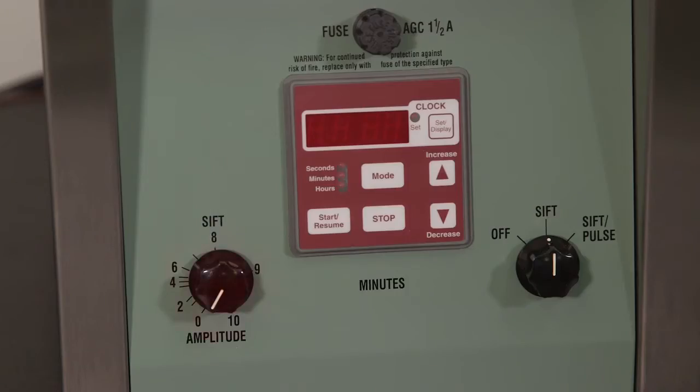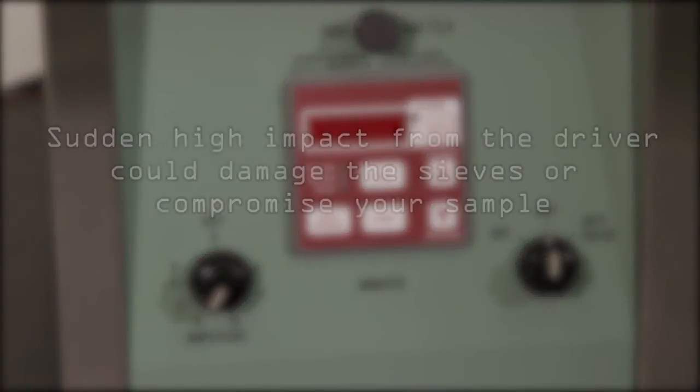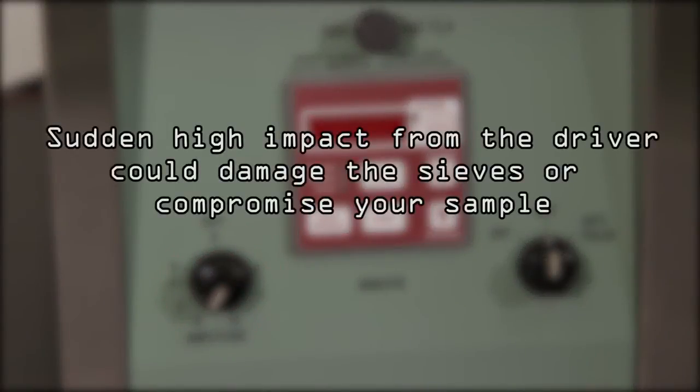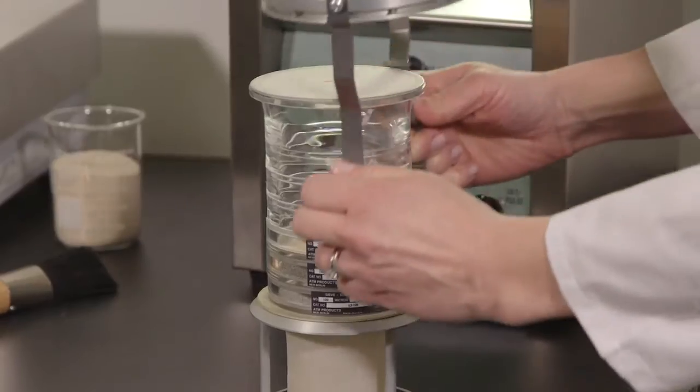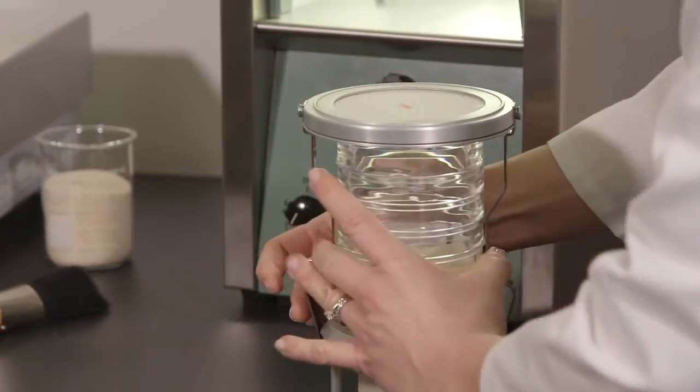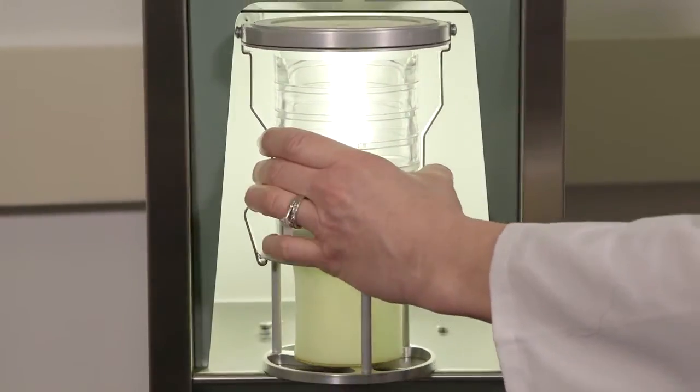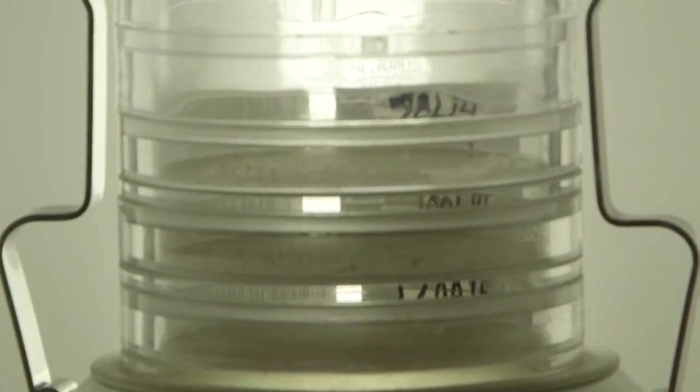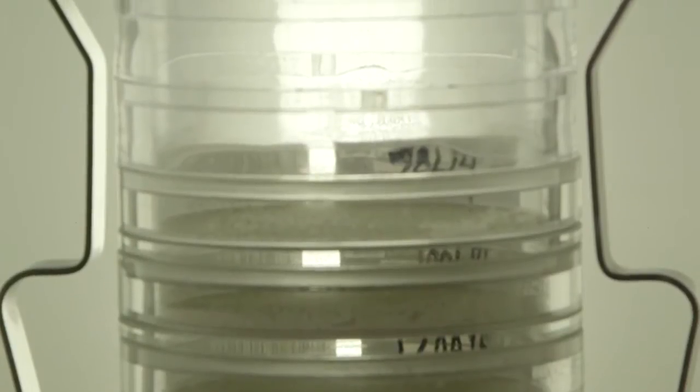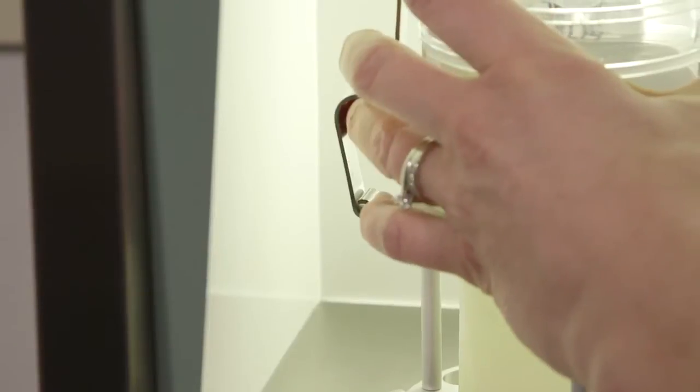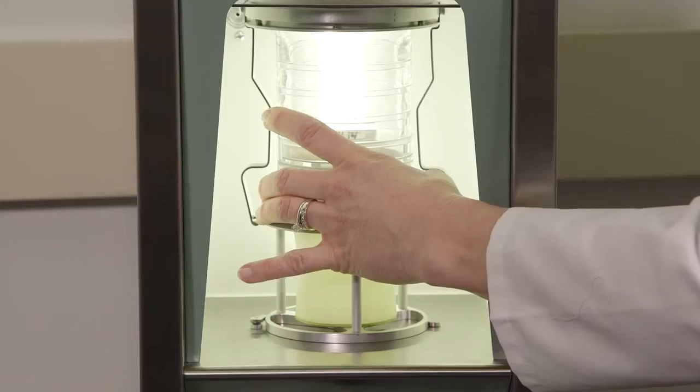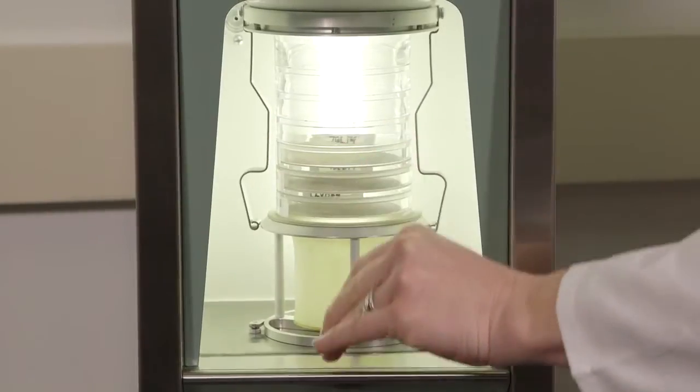Make sure the amplitude is set to zero and the timer is in clock mode or blank before starting. Sudden high impact from the driver could damage the sieves or compromise your sample. With the column lock arms clipped down, slide the test stack into the test chamber. Be sure to orient the stack in such a way that will allow for clear viewing of the sample. Release the column lock arms to form a tight seal. Lower the chamber door.